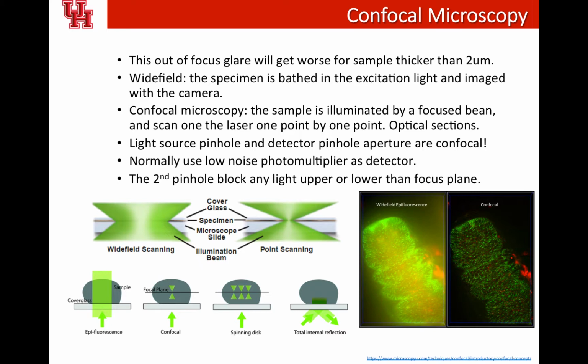So why is it called confocal? It's called confocal because the light source pinhole and the detector pinhole aperture are confocal. So that's why it's called a confocal microscope. Okay, and normally a low noise photomultiplier has to be used.